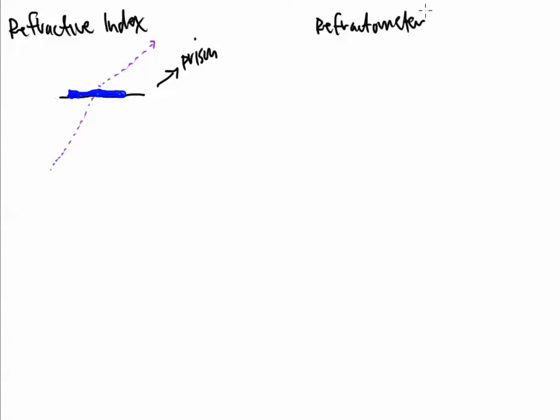Refractometer. Okay, so in a nutshell, basically, bottom line, that's what's going on with the instrument. Now, the good thing about this is that many of the liquid samples, they bend light a certain way. So this gives us somewhat of a fingerprint.